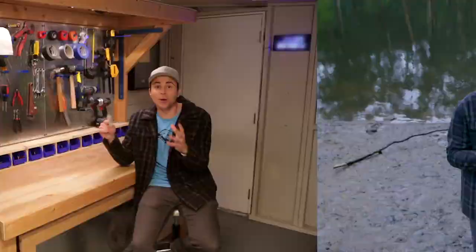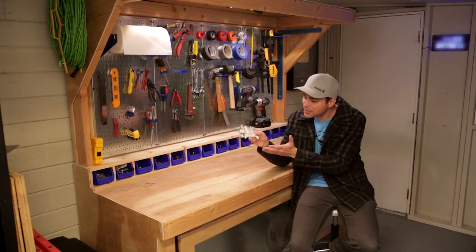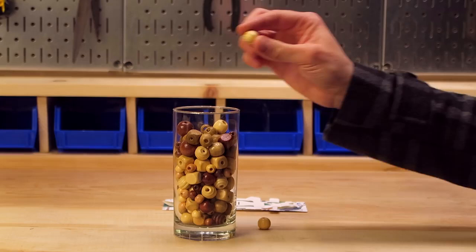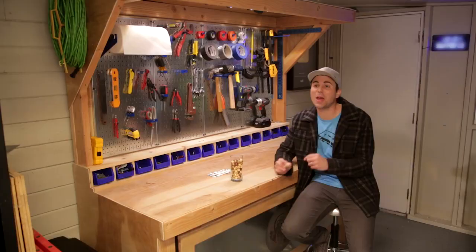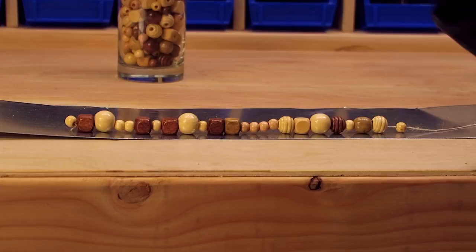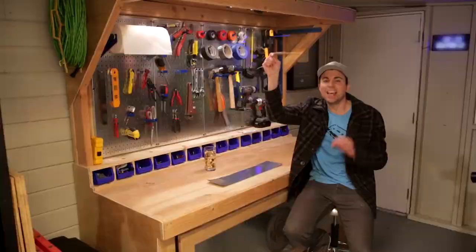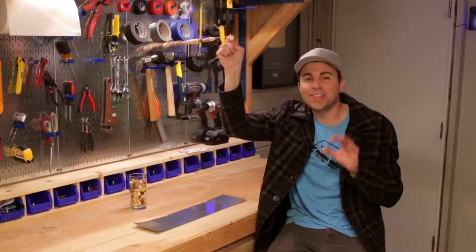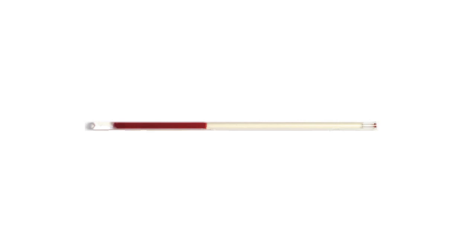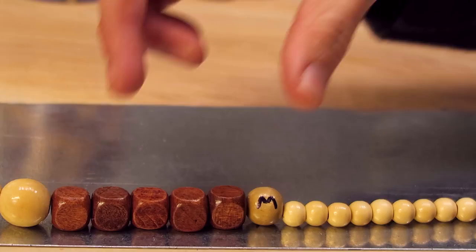I think that's such a beautiful analogy. So with this 50-cent paper microscope, you can actually see any malaria in your blood. We generally think of blood as a red liquid, but it's actually full of particles — like red blood cells, white blood cells, and platelets. In just a couple of drops of blood, you have a billion red blood cells, so it becomes a needle in a haystack to find the few that have malaria. That's where the centrifuge comes in. You take some blood, put it in a tube, and when you spin it really fast for a couple minutes, centrifugal force pushes the heaviest particles to the outside, displacing the less dense particles toward the middle. Since a malaria-infected red blood cell is slightly less dense than a healthy one, you'll always find it between the healthy red blood cells and the clear plasma.